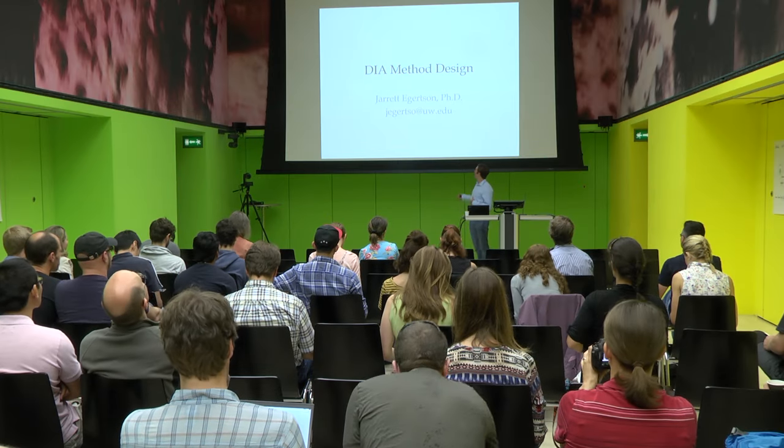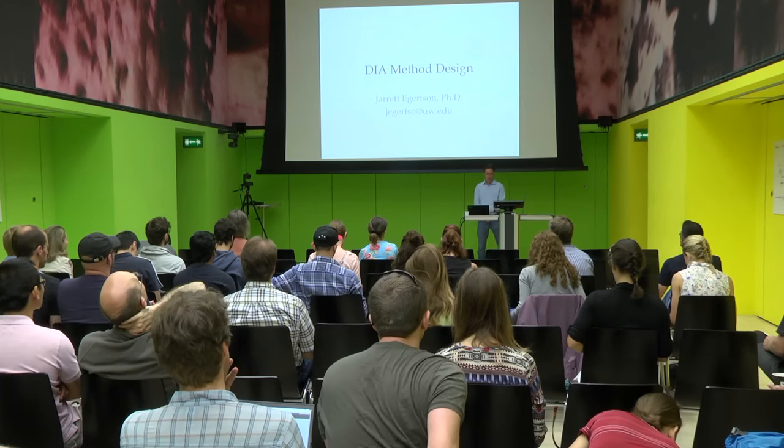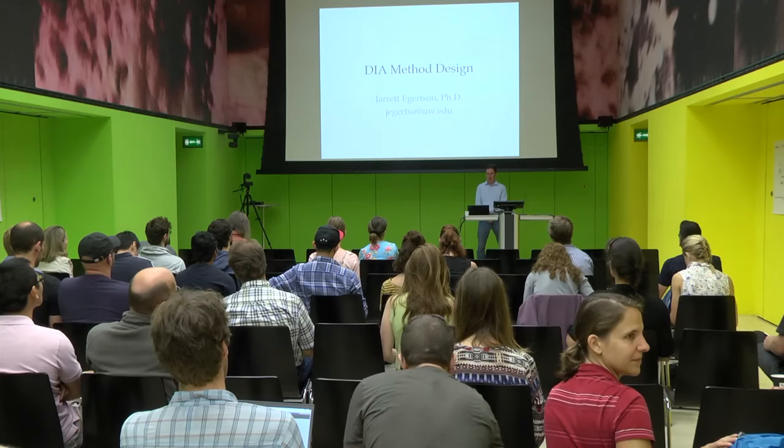This morning we're going to be talking about DIA method design. Actually, I was worried that this wouldn't be too relevant at first to people, but I've been getting a ton of questions about how to set up DIA methods, and really great questions from people throughout the course about a lot of these topics.